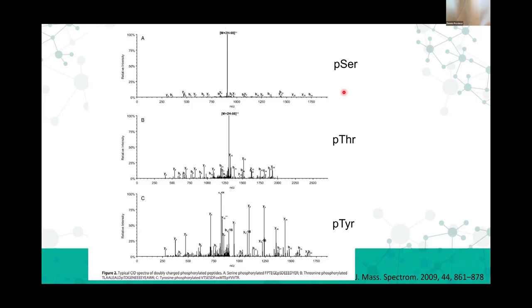It wouldn't be me without giving bad news, though. But the bad news is, only about 1% of overall phosphorylation is tyrosine phosphorylation. So if you're wanting to get tyrosine phosphorylation, it really involves another step of enrichment.